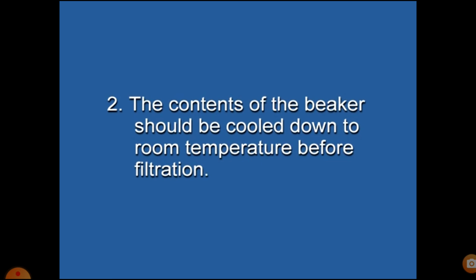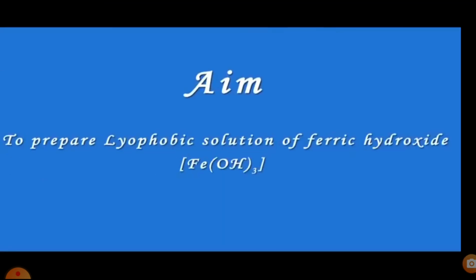So students, here we have learned about colloids, lyophilic and lyophobic. Now we will do the theory of lyophobic sol of ferric hydroxide.